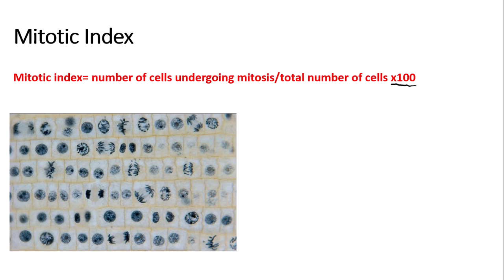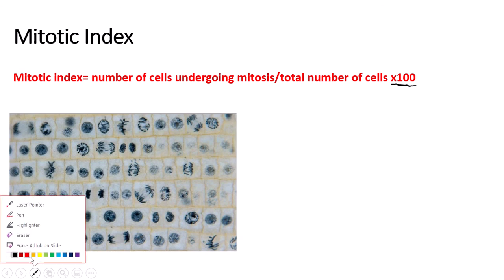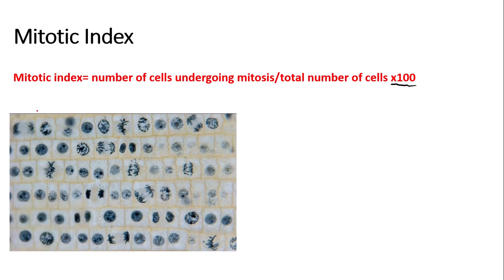So here is an image that I have stolen off the internet. Feel free to pause the video and have a go before I start. The first thing that we need to calculate is the number of cells undergoing mitosis. So if we change the colour of the pen to red to make it easier to see, we can start to count the number of cells undergoing mitosis.